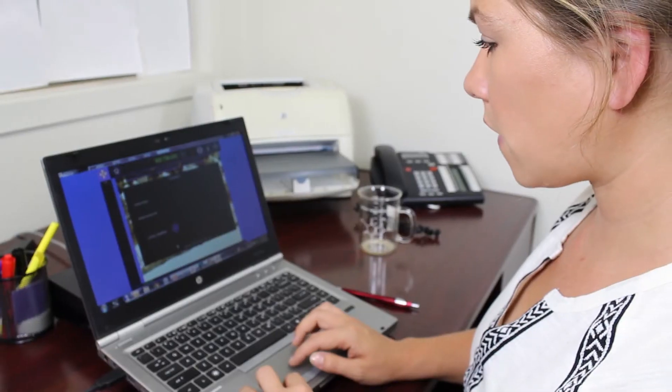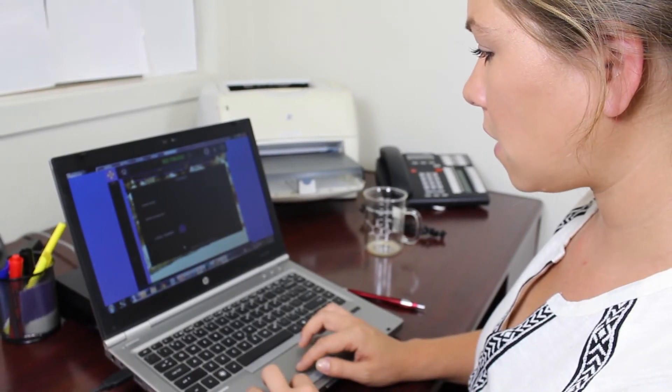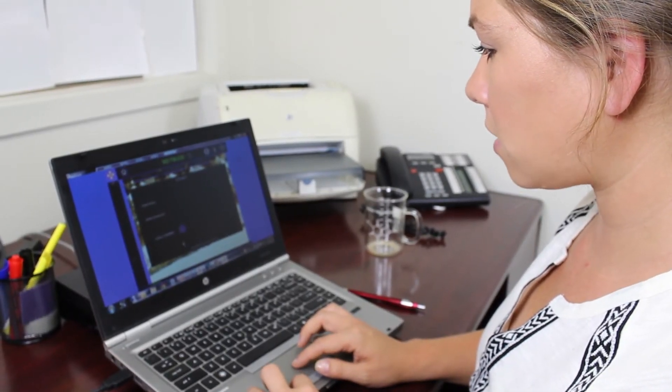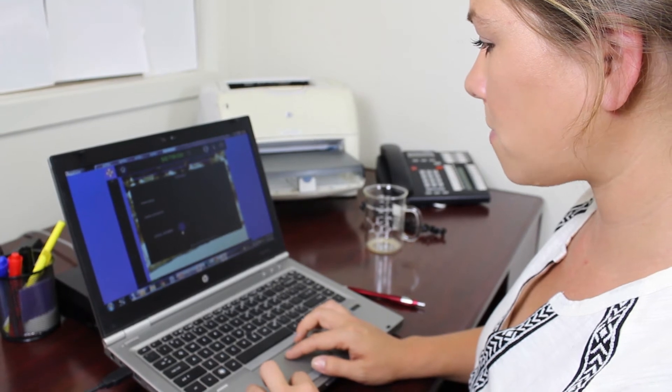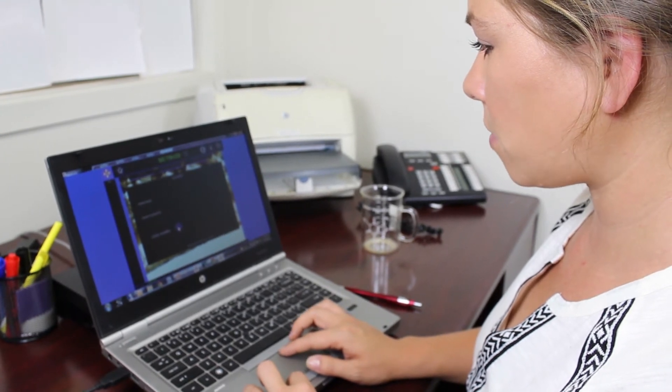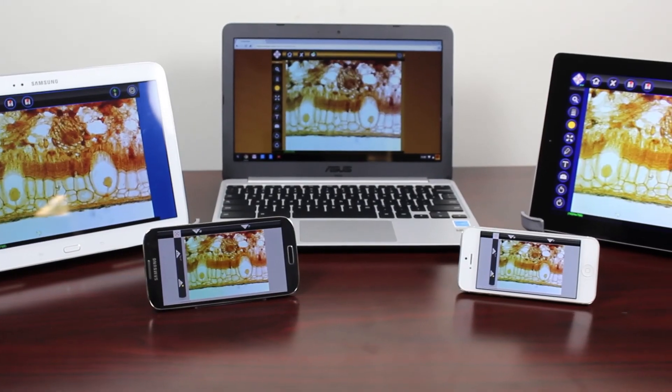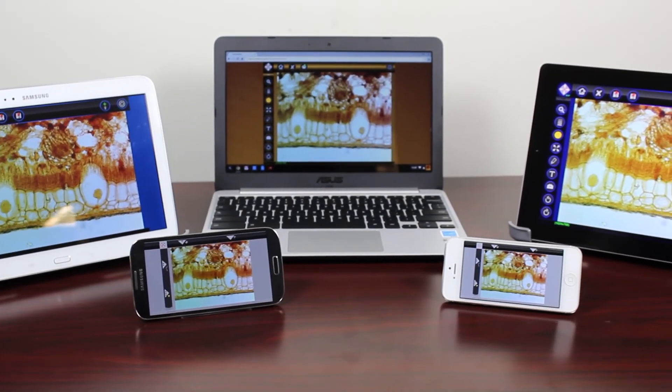EduCam brings the smallest of things up close and personal. Now imagine if I could share this live image with a single lab group, or even better, an entire class. With a click of a button, I'm able to share the image under my microscope with up to 40 students on any type of device.